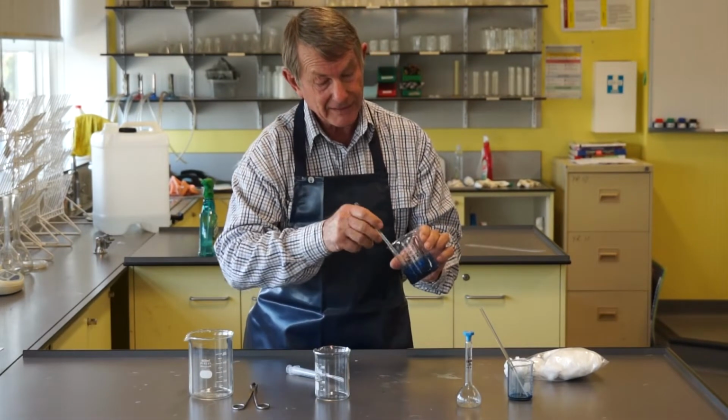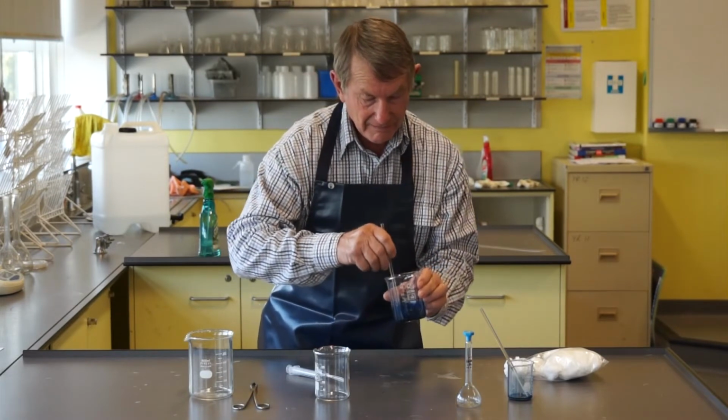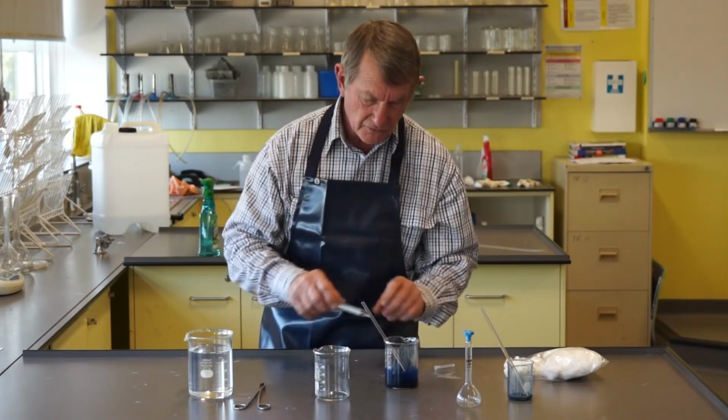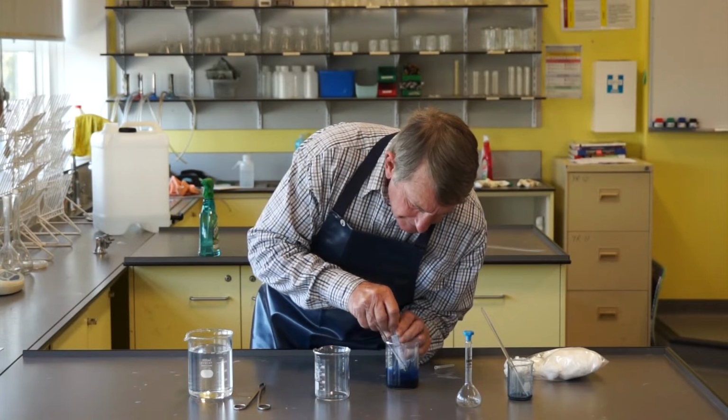We've got actually rather thick honey consistency. But it is viscous liquid. I'll just try to draw some of it up in the syringe. Let's see how we go.